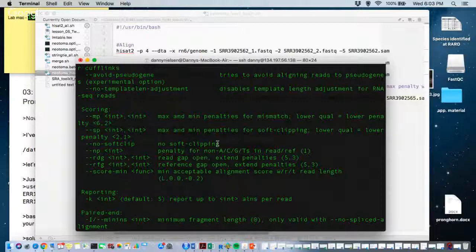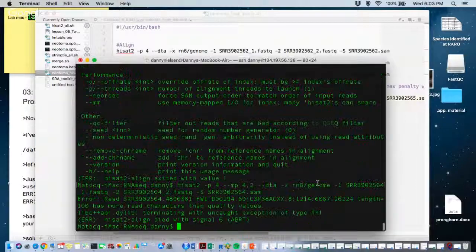So we'll be able to use our common sense to determine if the genes we're finding make sense. Because we know that this is liver tissue, we should be seeing genes that have functions involved in liver function. Okay.